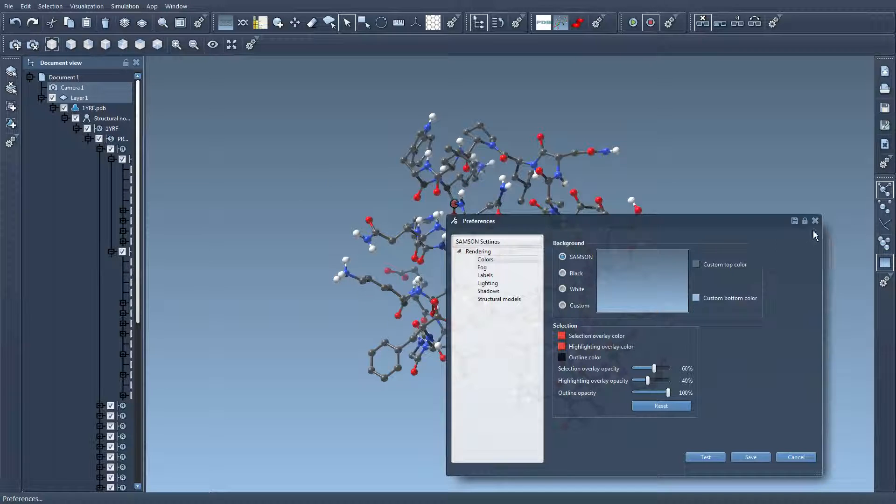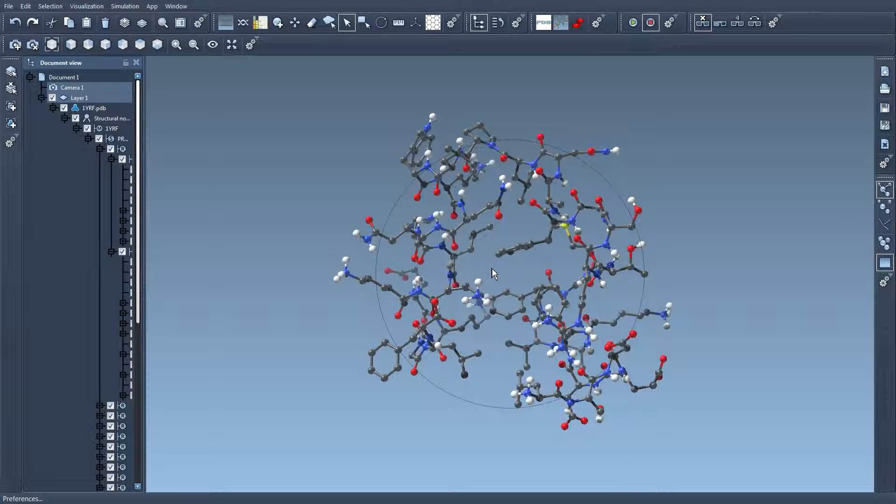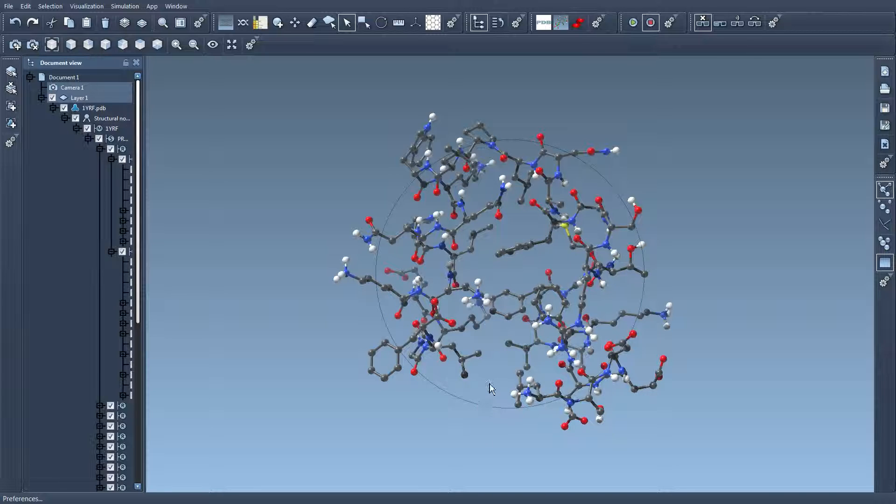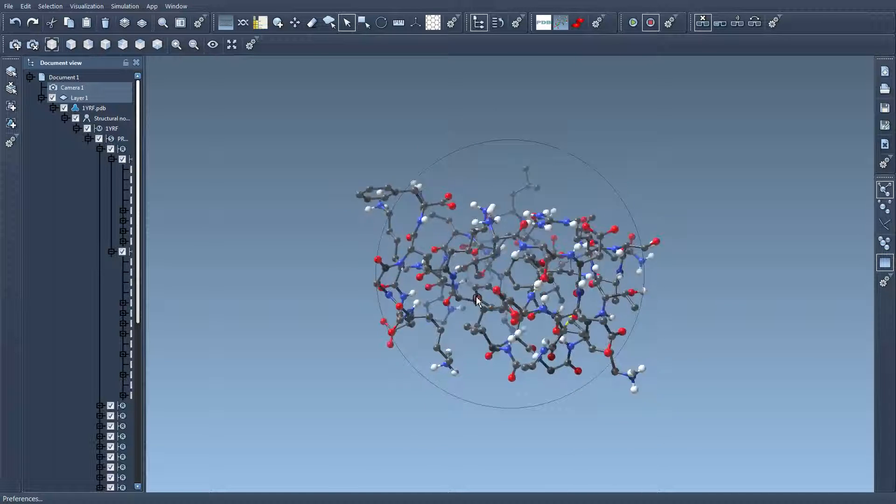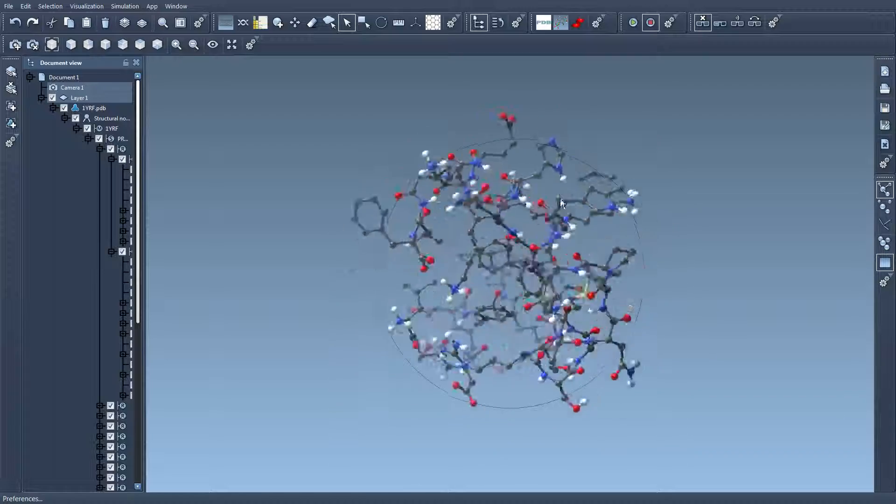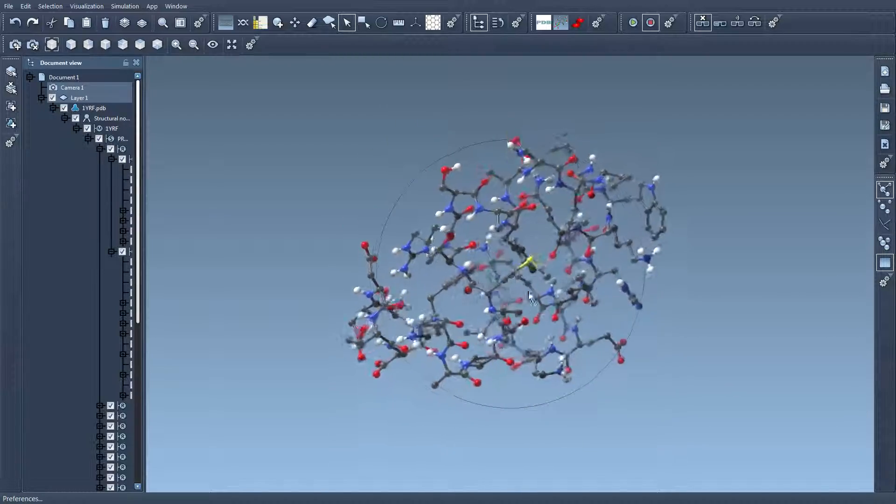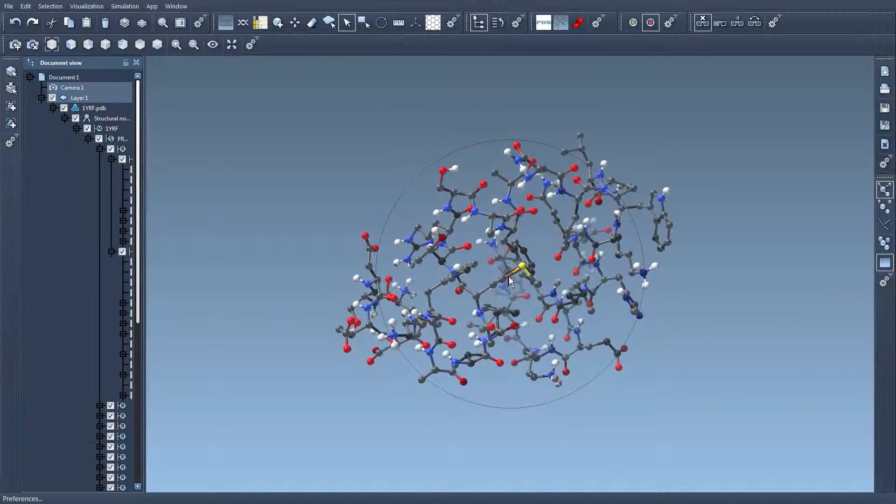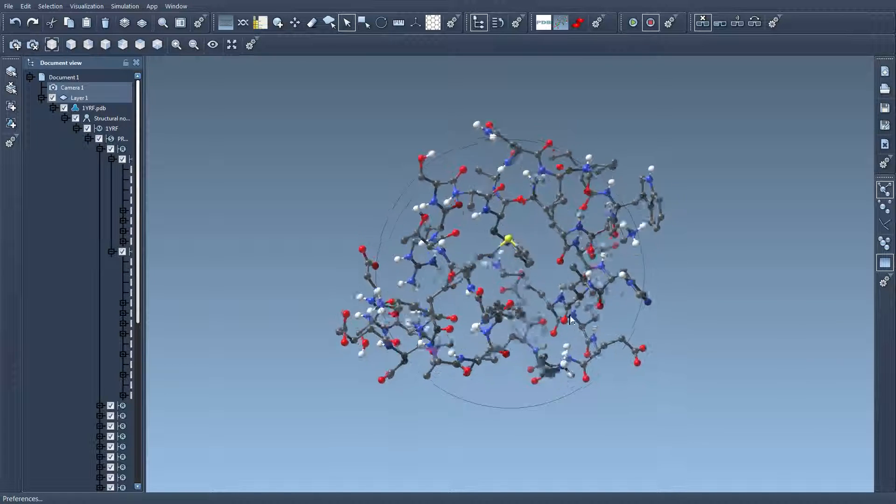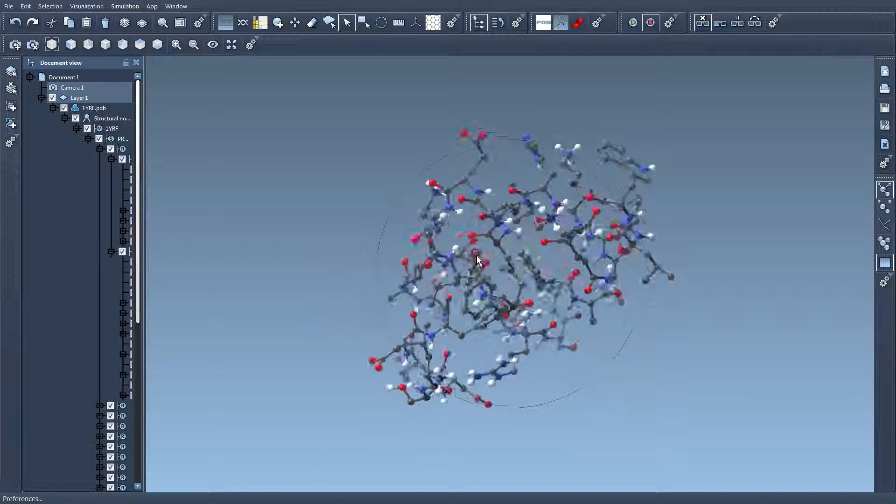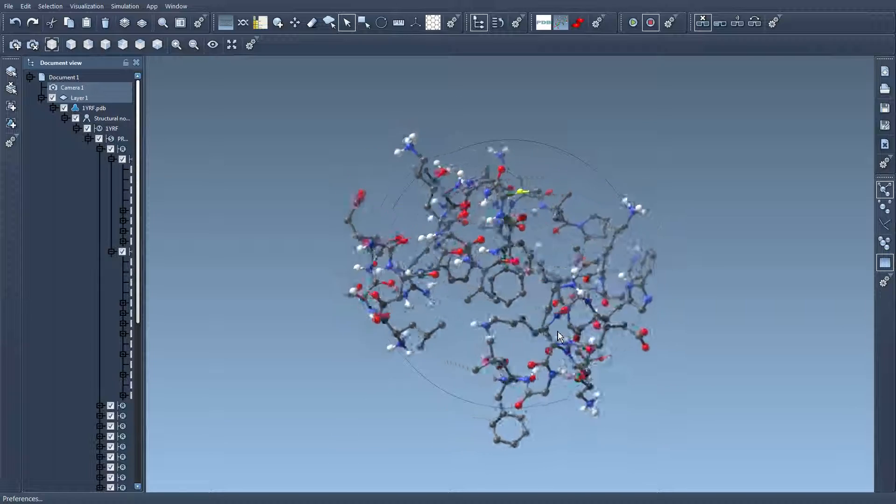I'm going to close this window here and press the shift key. You see that when I press the shift key a circle appears in the viewport. If I click on the left mouse button inside this circle then the camera is in trackball mode. Basically you can imagine that the viewpoint is rotating around this center here.